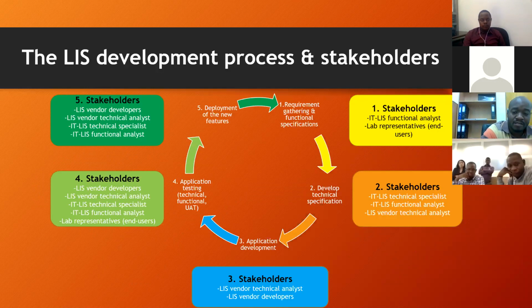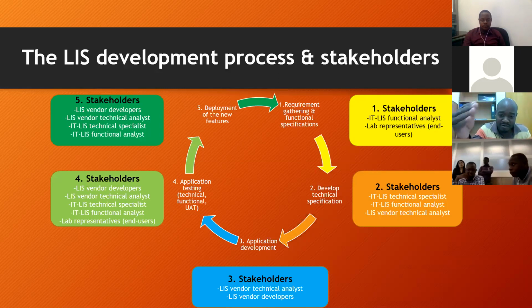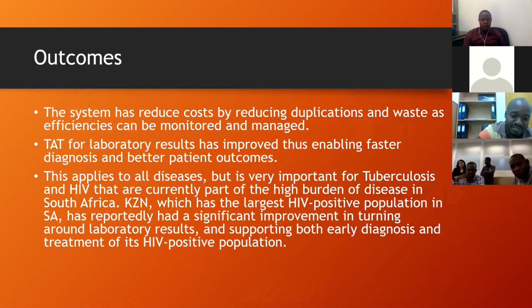Yes, so the slide you are seeing now shows you the development life cycle and the stakeholders that are involved in the case where you want to enhance the system or add new features, where we gather requirements, technical specification, application development, we do testing, and then we release the features into the environment. Next slide, please.